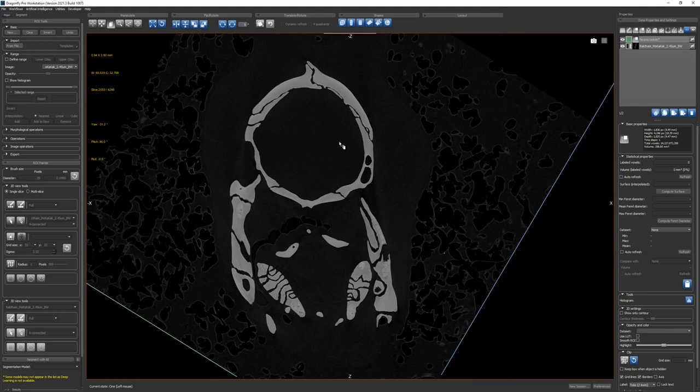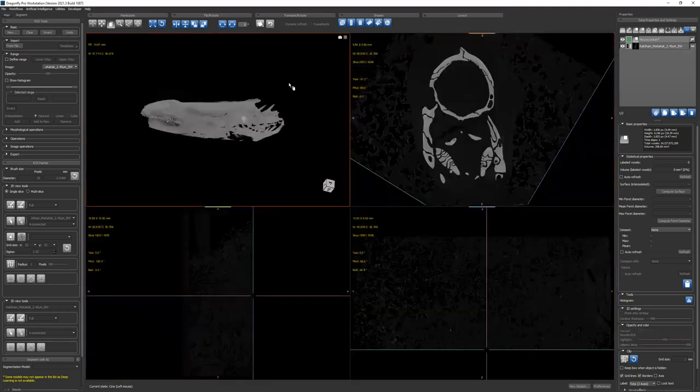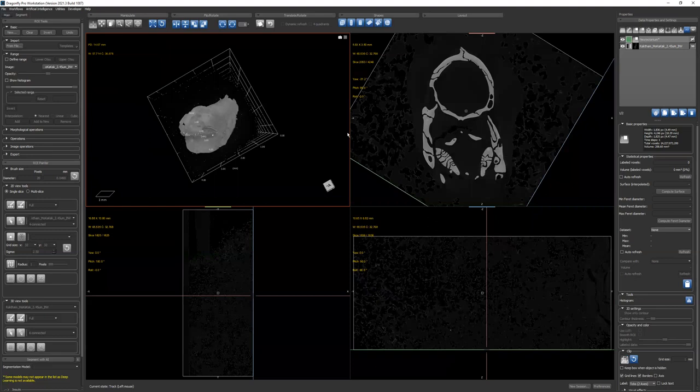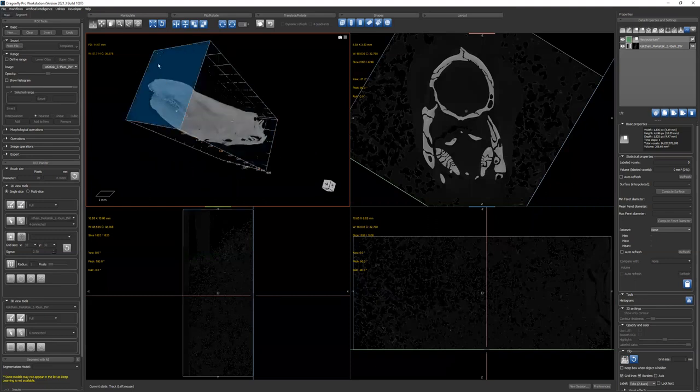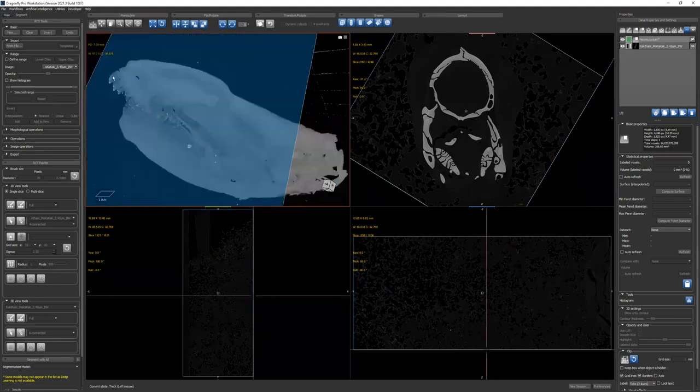It's literally like tagging something in a 3D coordinate system. So imagine you have a cube, and you do have a cube over here. It doesn't look like a cube, but it is, and you can actually visualize that cube. So if I find one of these teeth and I want to segment it, that tooth exists somewhere in X, somewhere in Y, and somewhere in Z, in a bunch of different ways because it's a certain shape.